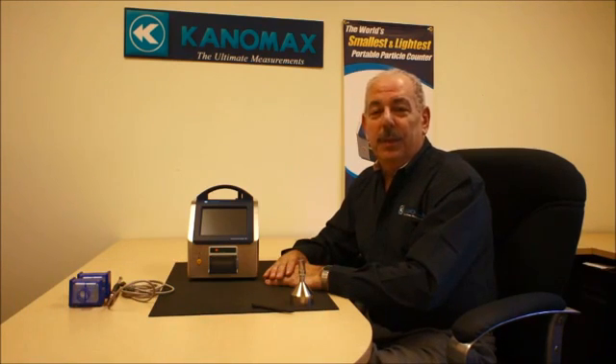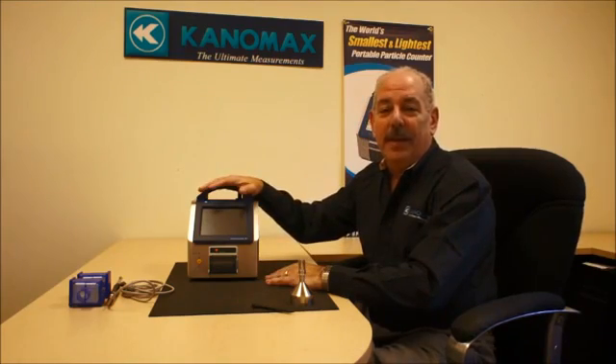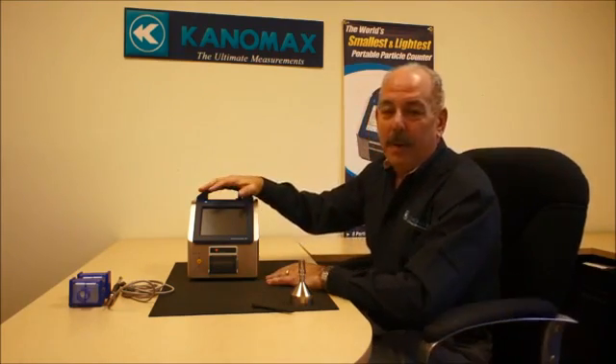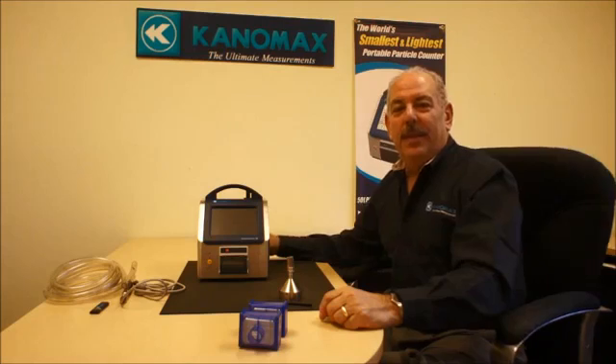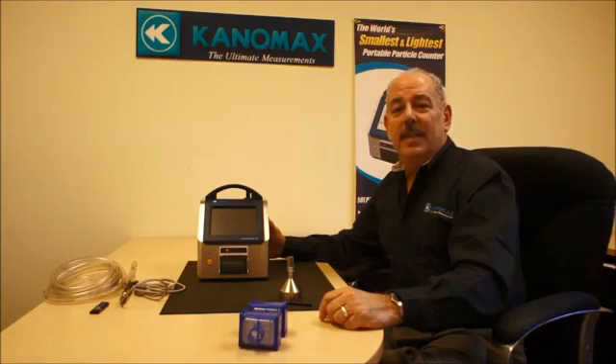Today I'd like to introduce you to the smallest and lightest portable instruments — particle counters in the industry — the 3905 and 3910 portable particle counters. The difference between the 3905 and the 3910 is that the 3905 is a 28.3 liters per minute flow, and the 3910 is a 50 liters per minute flow.